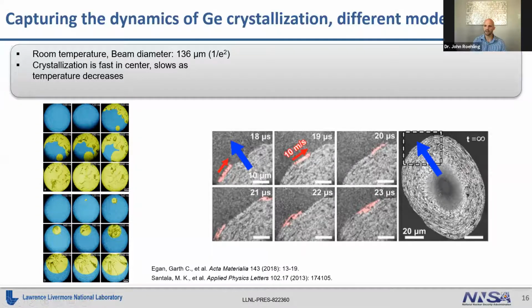And we thought at first that these growth rings were growing radially, but it turns out that they're actually growing in a spiral. And we were able to see these changes were due to both the thermodynamics and the temperature history, and match that up with some of the models that we developed.